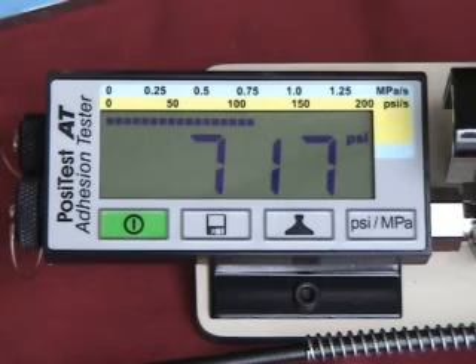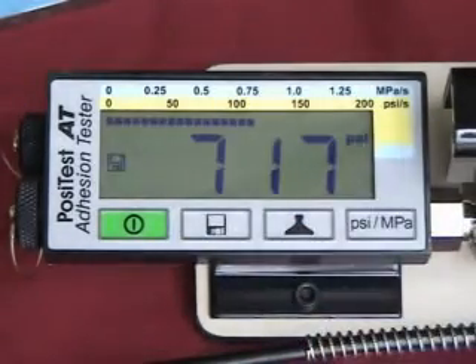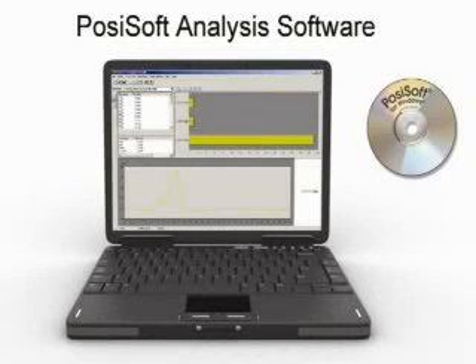After completion of a pull-off test, data from the reading — including pull-off pressure, rate of pull, dolly size, and test duration — can be placed into memory by pressing the save button. When readings have been stored in memory, the memory mode icon appears. Stored readings can be reviewed by pushing the save button or by downloading to a PC for further analysis.